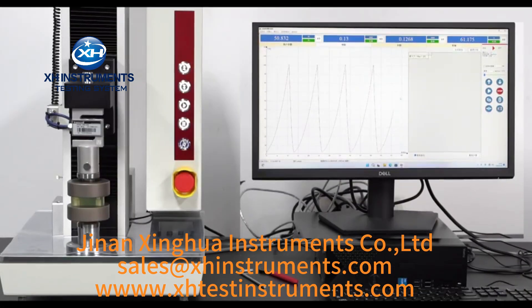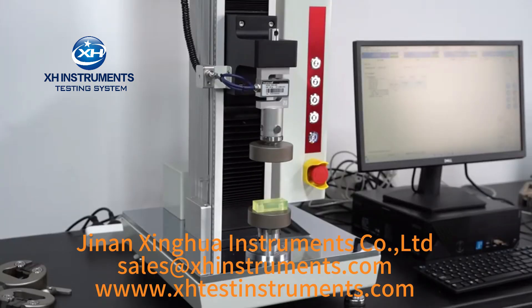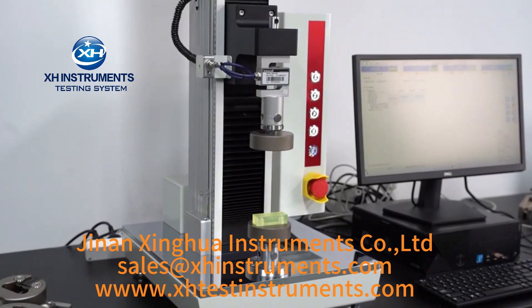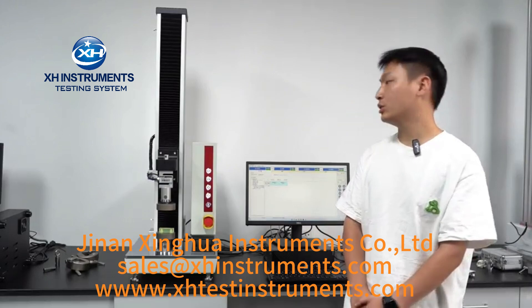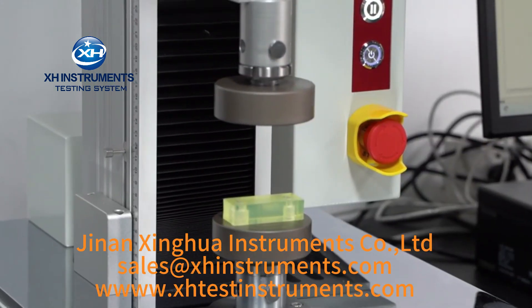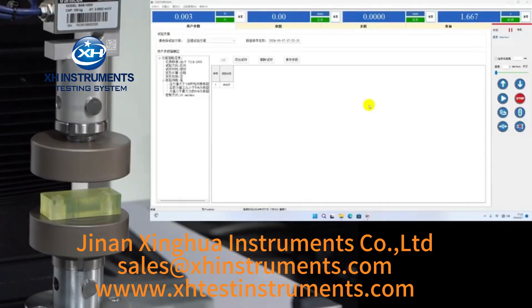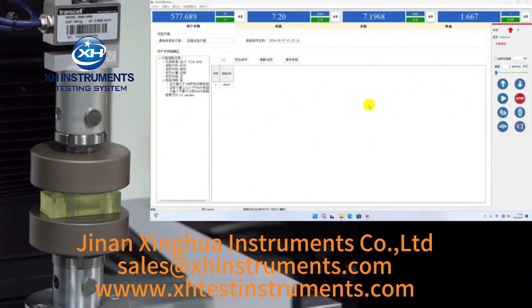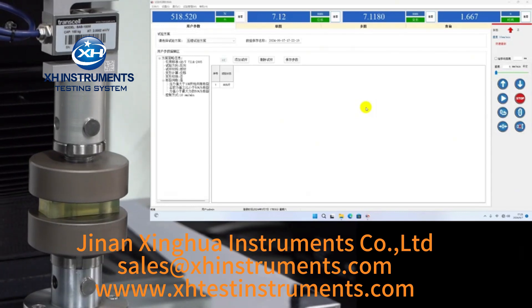can achieve up to 10 days of cyclic testing. When the device runs at a speed of 1,000 millimeters per minute, the noise is extremely low, with excellent noise reduction performance. The unique collision avoidance system can monitor fixture collisions or high-speed impacts during testing, automatically activate protection mechanisms, and prevent equipment damage. The system can effectively ensure equipment and testing safety, even at high speeds, making it very suitable for users who require high-precision and high-frequency testing.